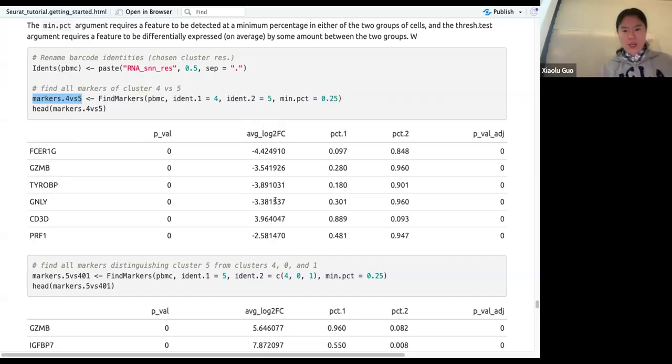Usually we don't know it, so you basically subsample from the data and then calculate the confidence interval, and the median you can report as the estimate.